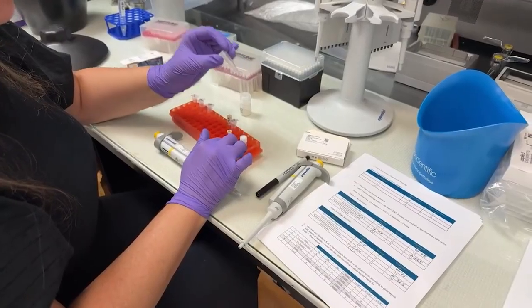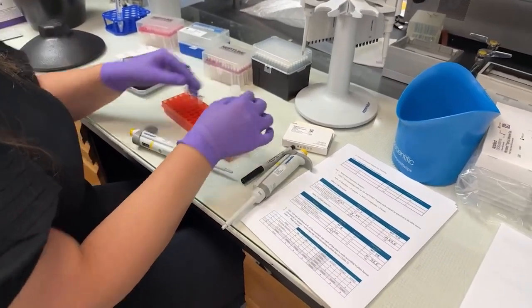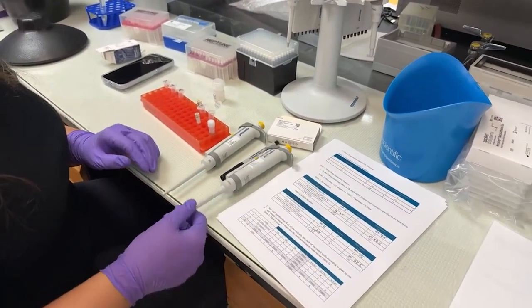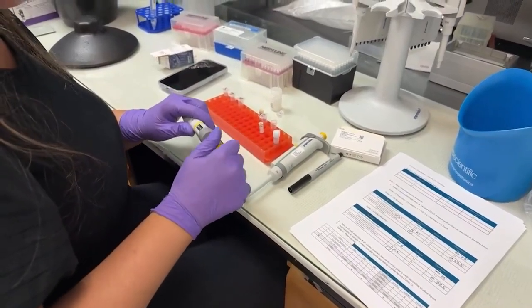Next, I'm going to prepare the same for the other test. Same process in exactly the same volumes. We have 75 microliters of our 2X master mix.